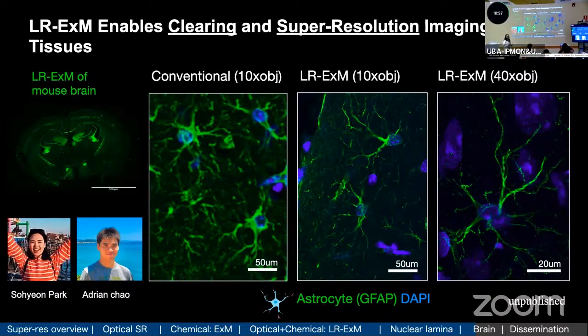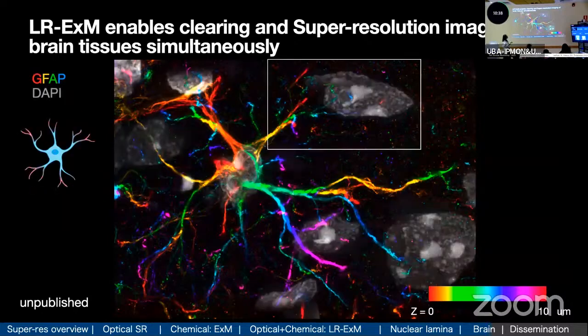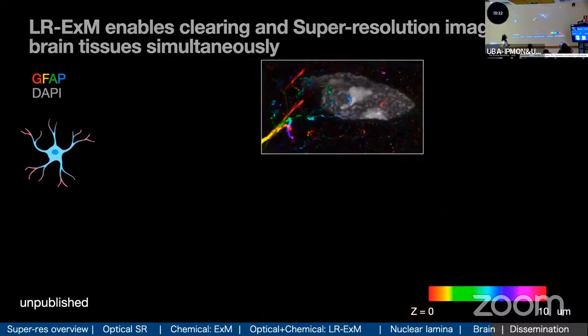And also we're interested in Alzheimer's disease, and the spatial arrangement of these cells near the amyloid plaque is very different from what you're seeing right now in the healthy cells. And again, you can see their Z information. This is color coded with Z. And you can see the surrounding cells when you add more markers. And here, what you are seeing in gray is just DAPI.